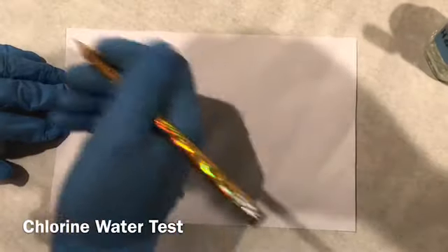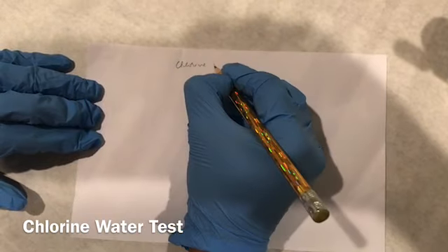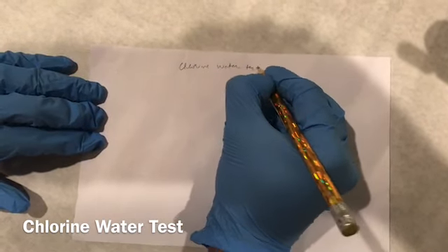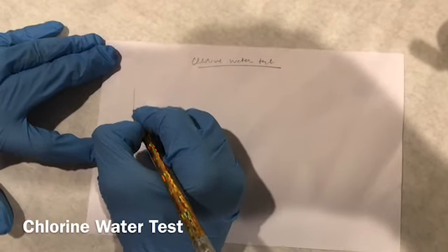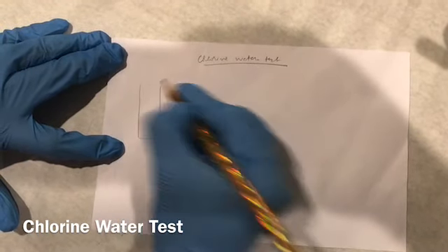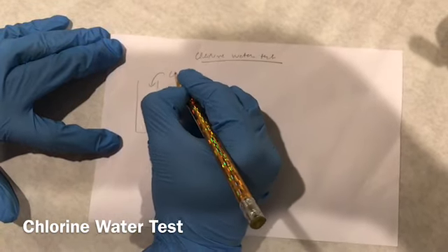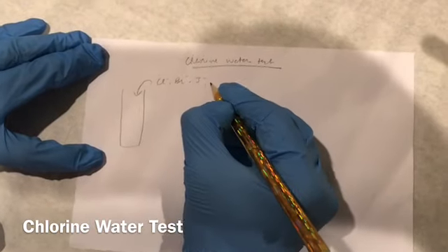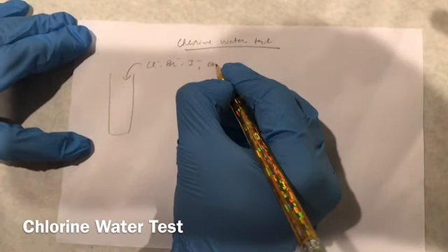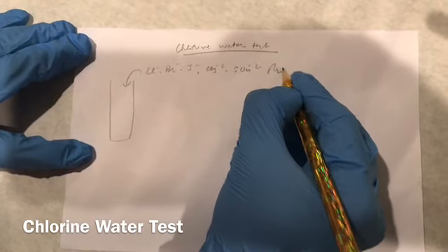So let me explain what happens in the chlorine water test. You just saw I added hexane into the test tube. So let's say this is the test tube. I added here solutions of the chloride ion, bromide ion, iodide ion, and carbonate, sulfate, phosphate.